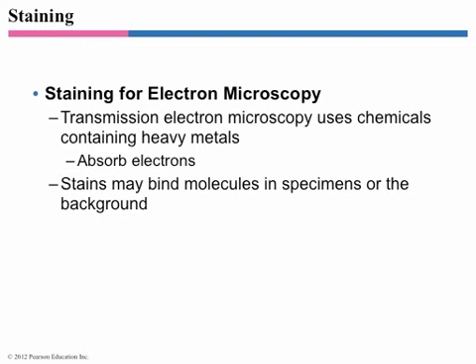I just wanted to point out, so the reason why you use colors to stain for light microscopy is because colors interact with light. What are you looking at in electron microscopy? Electrons. So would a colored dye do anything? What do you want your dye to interact with? What interacts with electrons? Metals. Heavy metals. Actually, it's nuclei. Any big nuclei. So you want to choose things from the bottom of the periodic table, which are almost always metals.